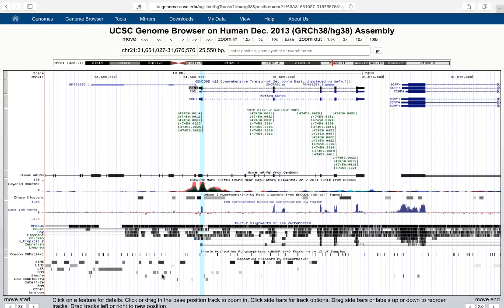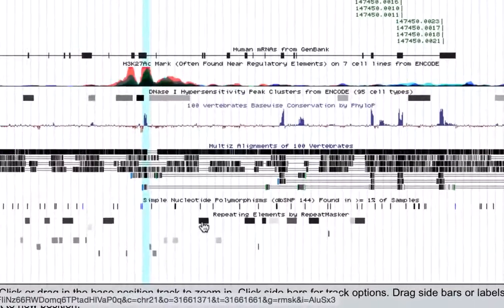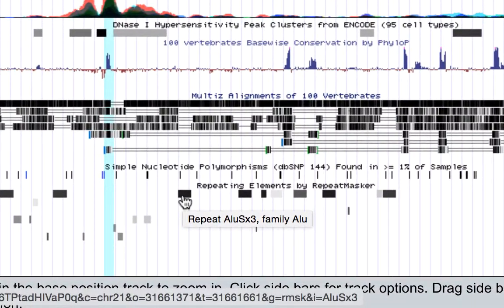Finally, below the common SNPs track you have a repeating elements track. A program called RepeatMasker scans the genome and predicts where there are regions of low complexity or repeating DNA. These are shown as rectangles on the genome, and they're broken out by type — so you have short interspersed repeats like ALU repeats, long interspersed repeats, and other types. You can see that within the SOD1 gene there are different types of repeats — these are ALU family repeats, for example.